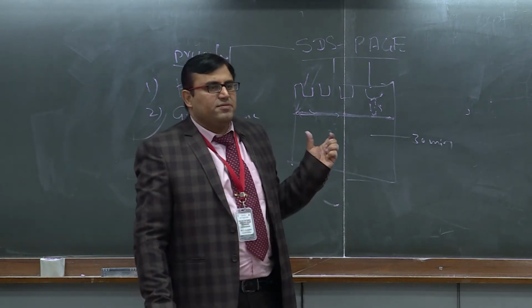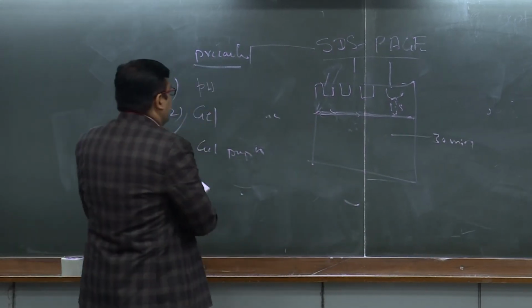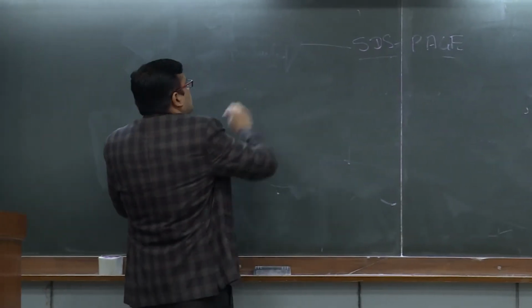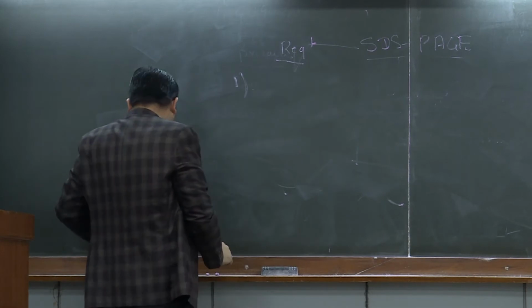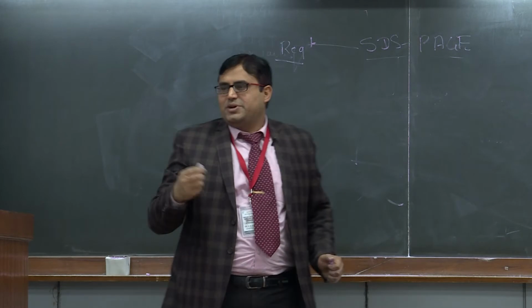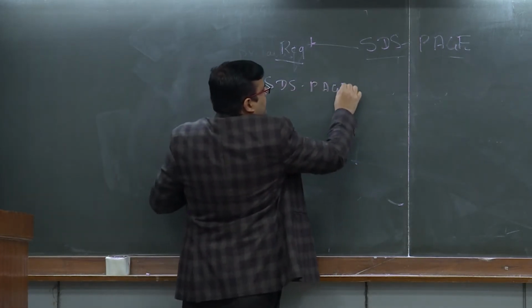So with this brief, let me take you to the workflow chart of SDS Page. So first thing is requirements. What are the things which you require? As I told, the first thing which you require is the instrument, the SDS Page unit.